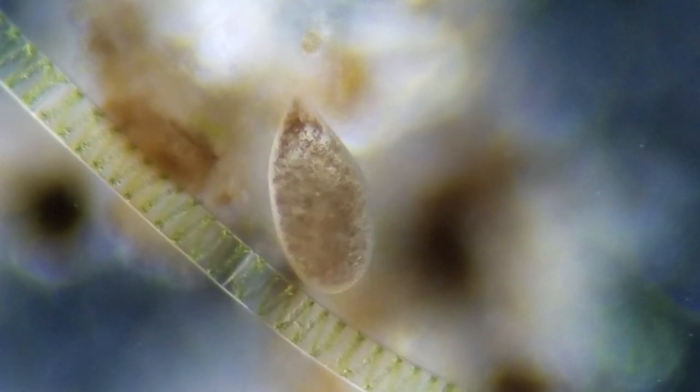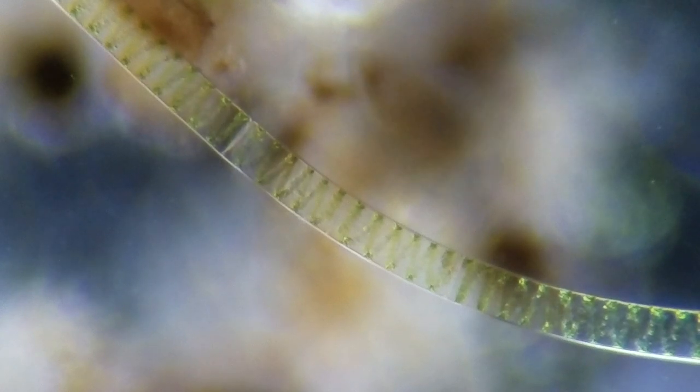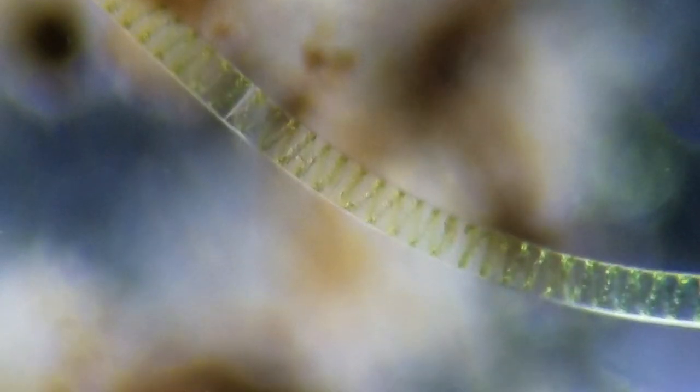Notice this green stalk that he's against right here — looks like a stalk, this is algae right here. And I want you to notice the inside of this right here, enlarged. See that spiral? This is called spirogyra. Spirogyra, because it makes a pretty spiral. Let me touch the aperture a little bit. See how that looks — it makes a spiral, kind of like a candy cane spiral. Spirogyra, that's what that is.